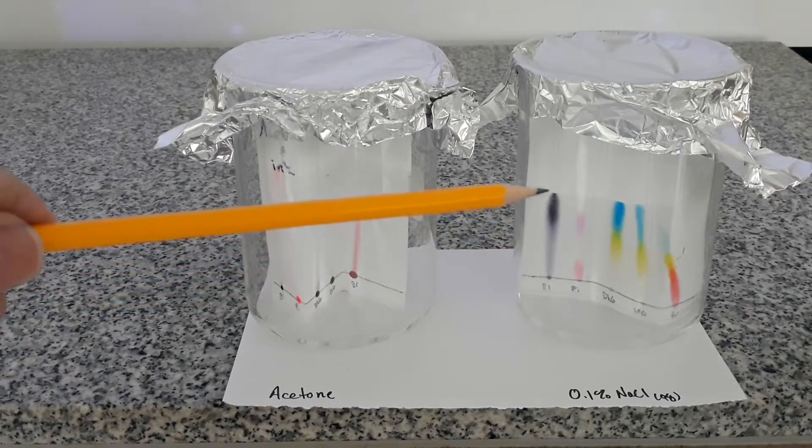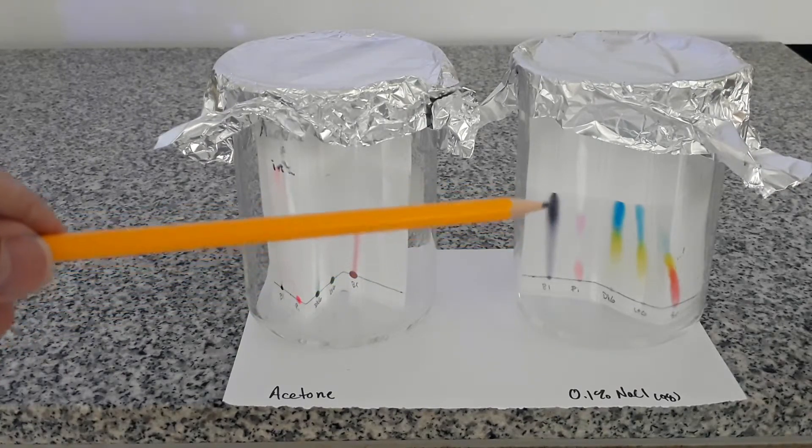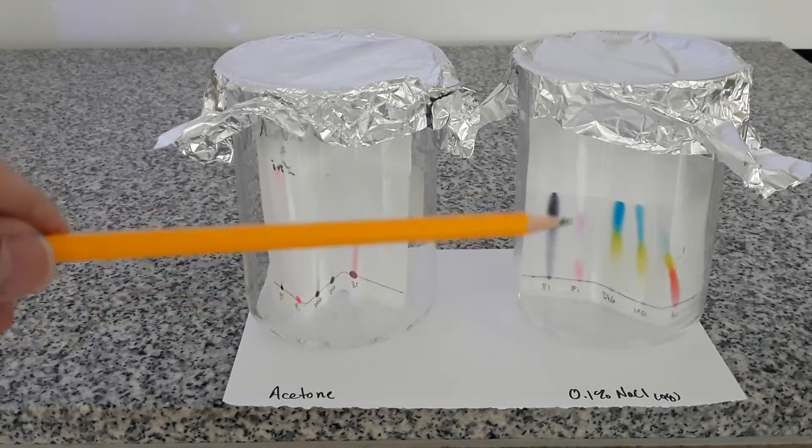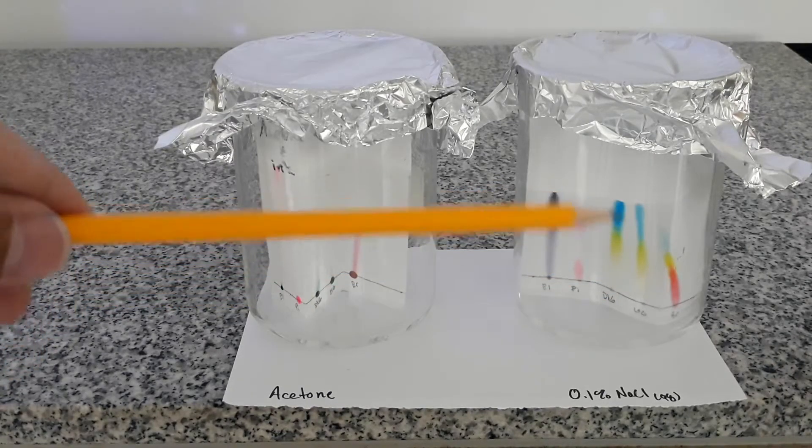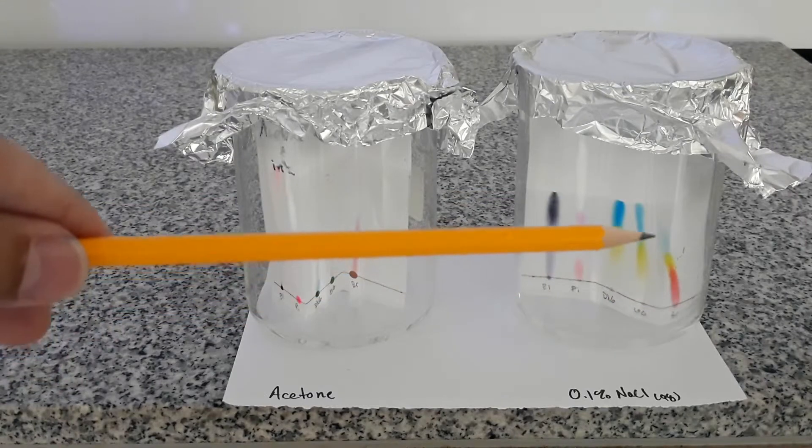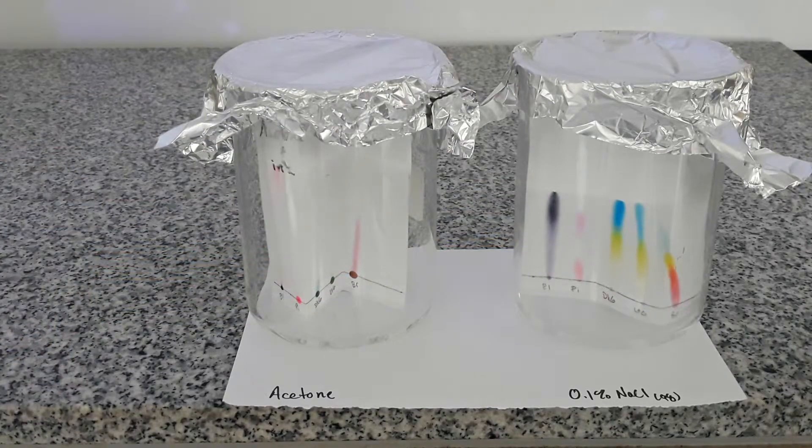We can see we're getting some nice separation here. The acetone separated fewer inks but we have some colors separated there and the sodium chloride has some really nice color separation between the different components of each of the pigments.